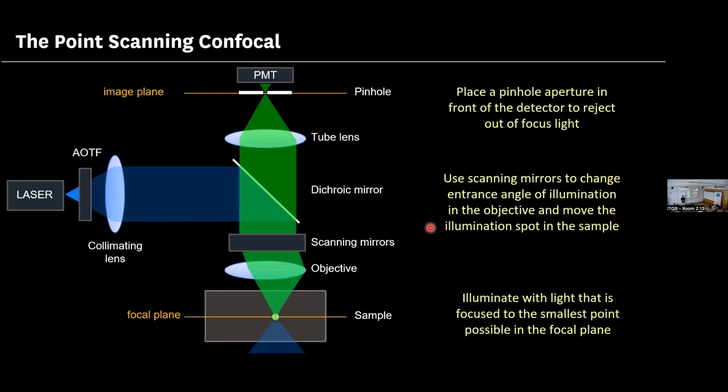And so you can move them 10 nanometers apart. The optical resolution of the microscope will be dictated by the numerical aperture, so you would be overscanning in this case. The resolution is not higher than 200 nanometers, but you can set them to Nyquist, 100 nanometers. I'm sure David told you about this. Or you can space them further apart and acquire with a lower resolution, but much, much faster. This is one of the advantages of the confocal microscope, by being able to control how the sample is scanned. You can choose between speed or resolution. We'll see about that in a minute.